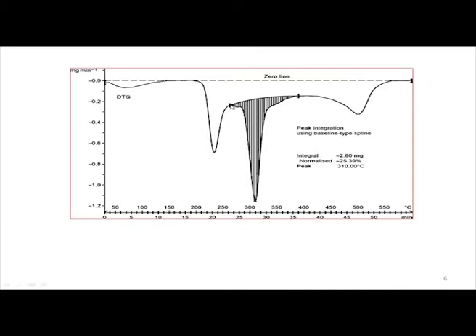What is happening in the real sense is that when we try to go back to the baseline, the temperature is nearby, this temperature is close by. So, the recording for the second peak is also commencing. The commencement of the second peak immediately after the first one will not allow the baseline to touch the 0 line, it will be like this.